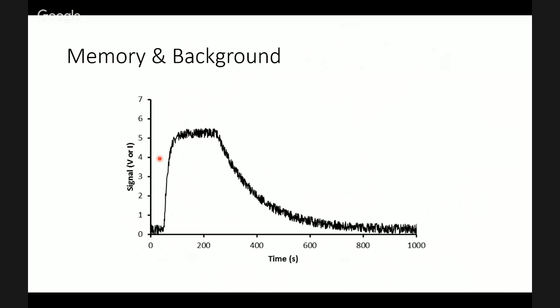So this is the case where we, for instance, just move on. If we've got time along the bottom, we might put a sample into our mass spectrometer, and then the signal will increase, and then we might measure it for a bit as it's kind of sucking up the sample, or the sample kind of being ionized in the gas chamber or something like that, and then we stop measuring our sample, and over time the signal gradually declines. And it goes back to somewhere near where it started. We never go back to zero because we always have some background noise in our system.